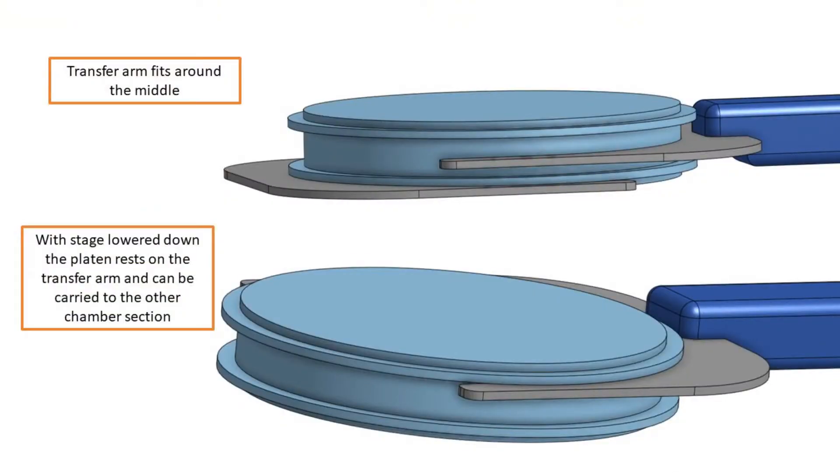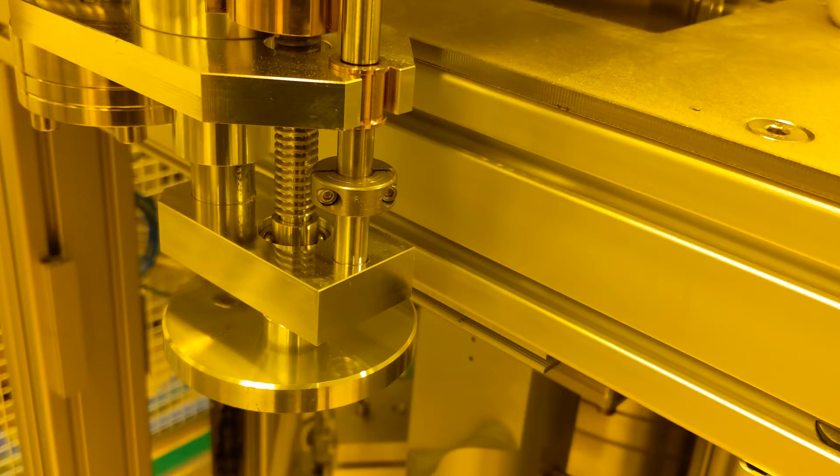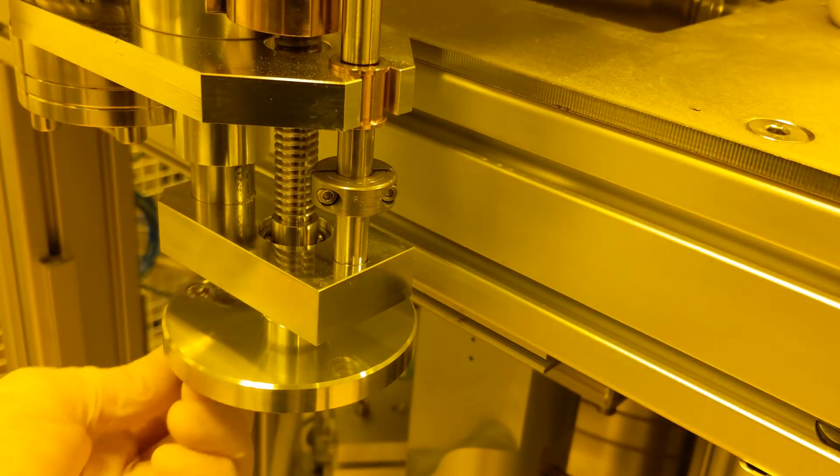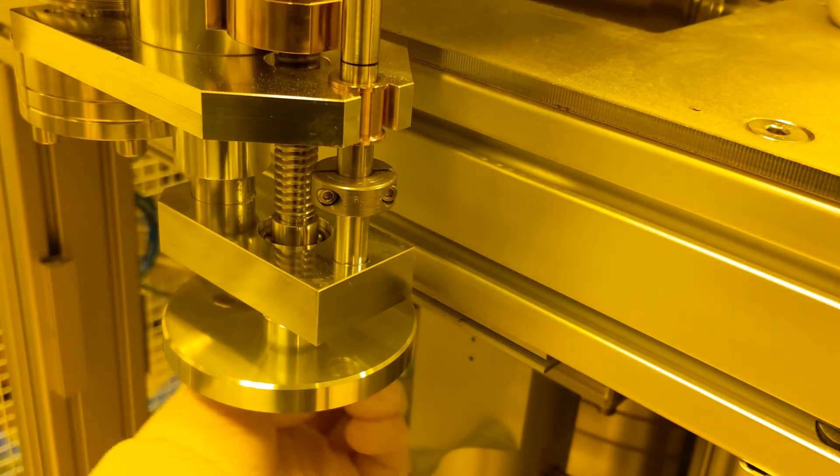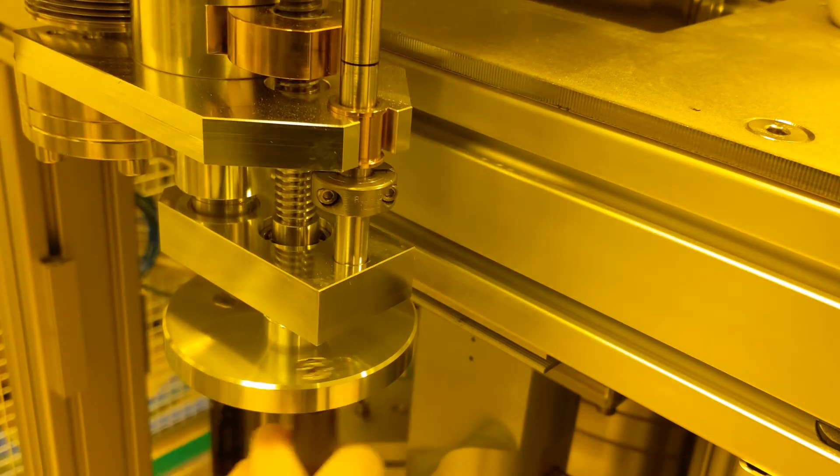Let's take a look at how the transfer arm grasps the platen. It fits around the center of it, much like how it sits on the stage below it. Once in this position you can lower the stage until the platen rests on the transfer arm entirely, allowing you to carry it to the other chamber. Then lower the platen stage down, allowing it to rest on the transfer arm so that you may retract it into the main chamber.